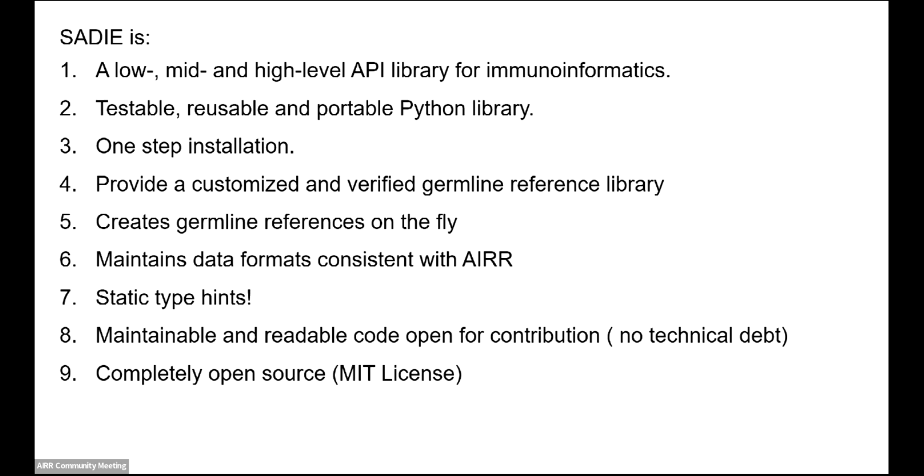It maintains data formats consistent with AIRR. Of course they do, or else I wouldn't be here. We have static type hints. If you don't know what that means, no problem. We can discuss it later. We have maintainable and readable code. We have a way we'd like to write code that's consistent and could be picked up by anyone. It's completely open source, so we'll take on anyone.